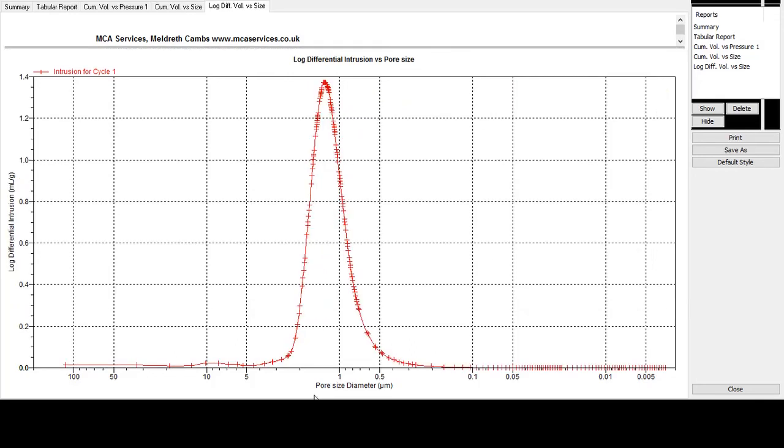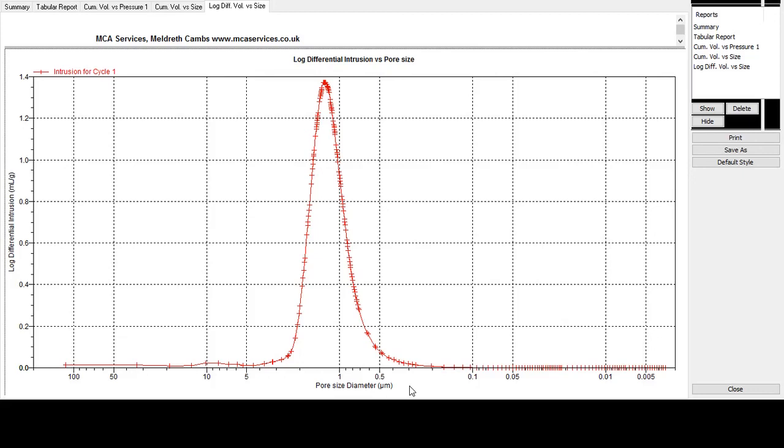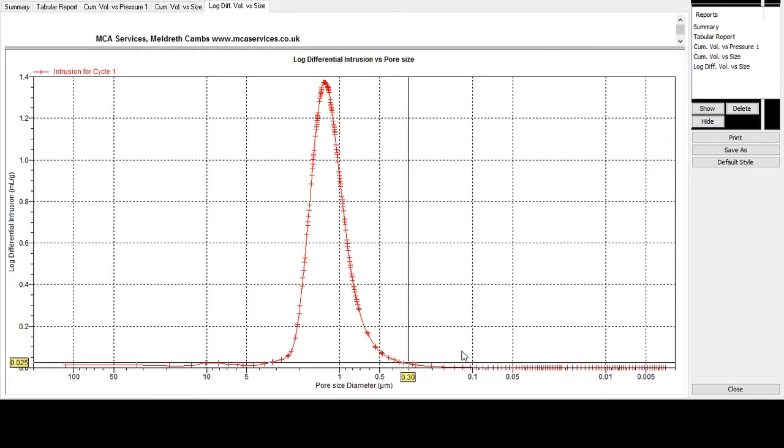Pore size now is on a logarithmic scale. And this is really useful for visualizing the pore size distribution within the sample. We can see that the big peak here shows the distribution of pores, and they're starting at around about 5 microns down here and running up to or down to 0.3 microns diameter. And this peak is centered at 1.3 microns.